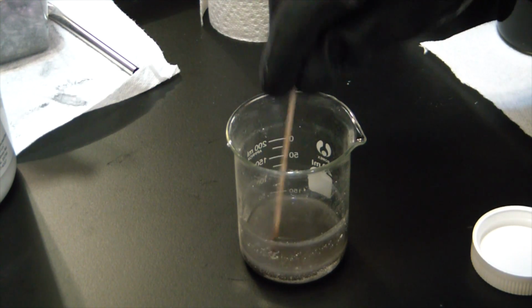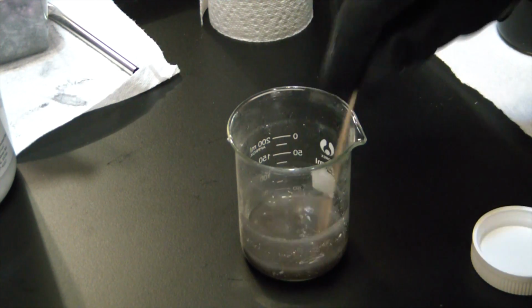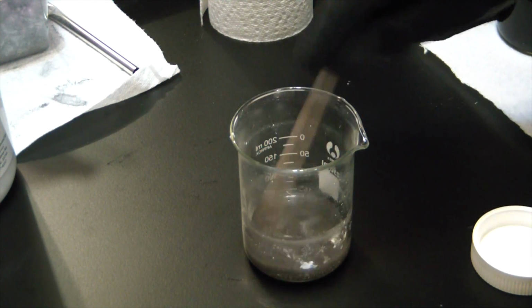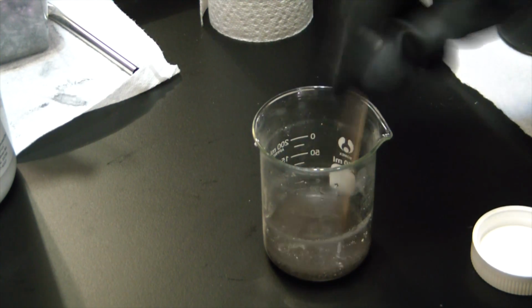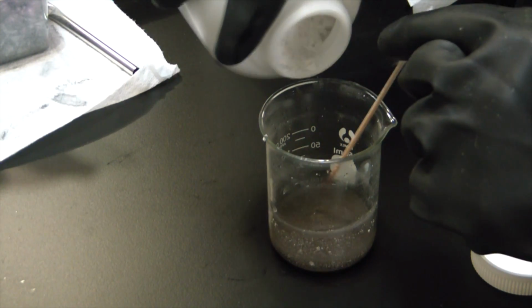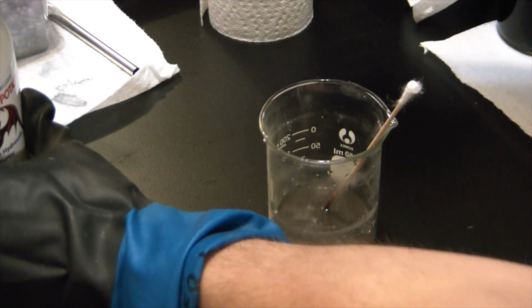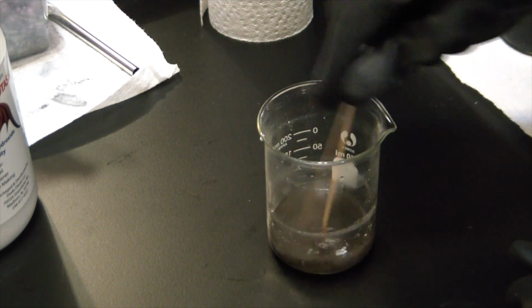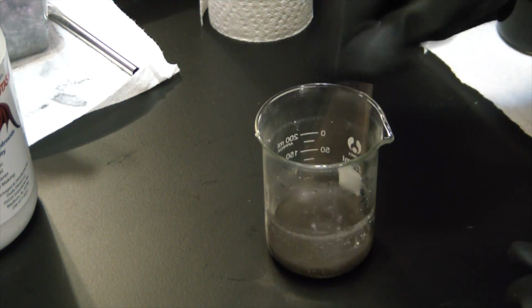Trying to break up any little clumps of silver chloride that I still see. Still a little bit of chloride in there. Cap off my potassium hydroxide. Stuff absorbs humidity from the air like crazy, very hygroscopic.